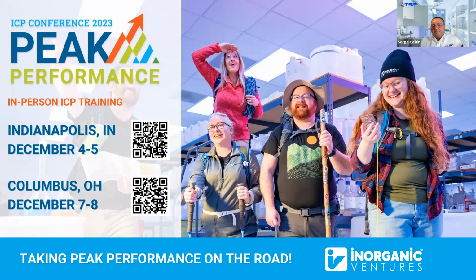So things like that. I would also say just make sure that you have your peak centered properly and your background points are set correctly. You may need to go in and look at the spectra itself to see what your background is doing, because you may need to use a single-sided background point if you have an interference on one side or the other.